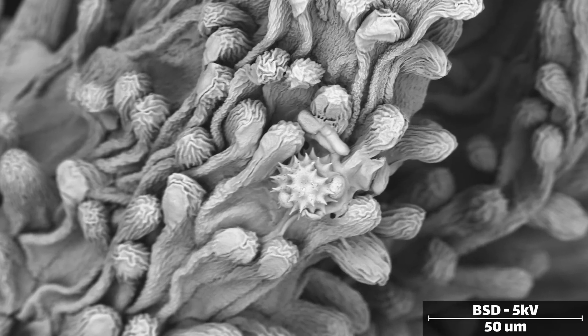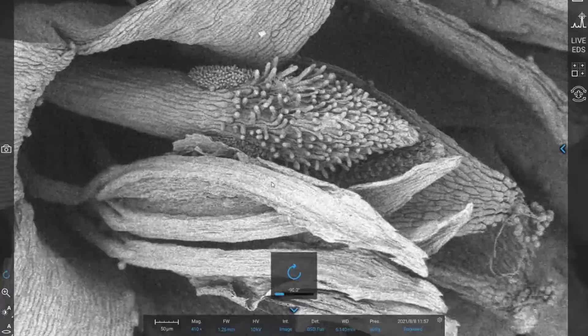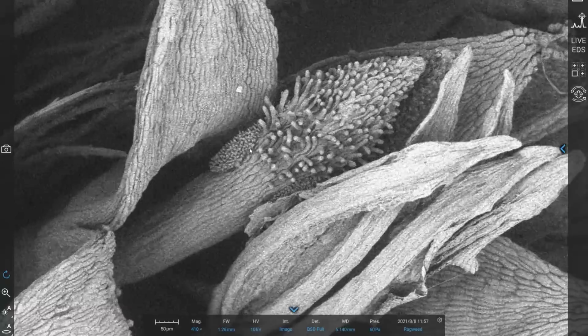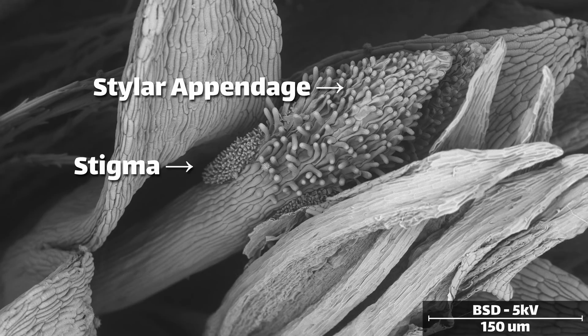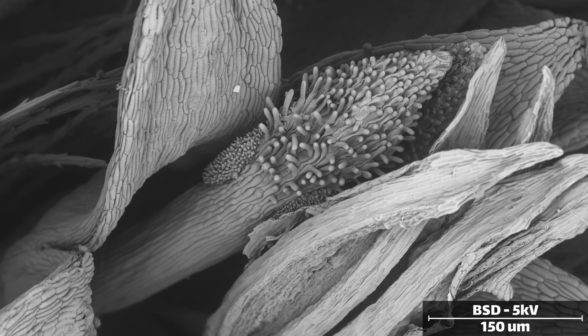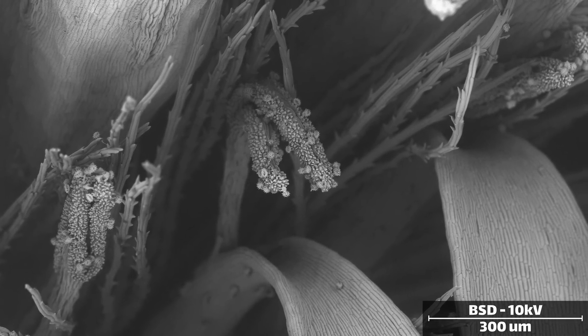The entire female portion of a flower is known as a pistil, and on the goldenrod, some pistils have an even more fingery appendage on top of the stigma. This is known as the stylar appendage. Frankly, I spent too long looking through my textbooks trying to determine the function of the structure, with no apparent success. If someone knows, please share in the comments down below.